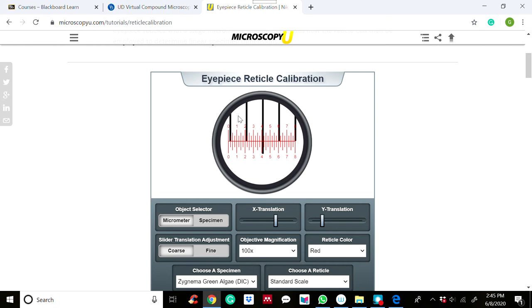When you purchase the stage micrometer, the manufacturer will tell you what length one division equals, so that you can use it to calibrate or determine the eyepiece graticule scale divisions.